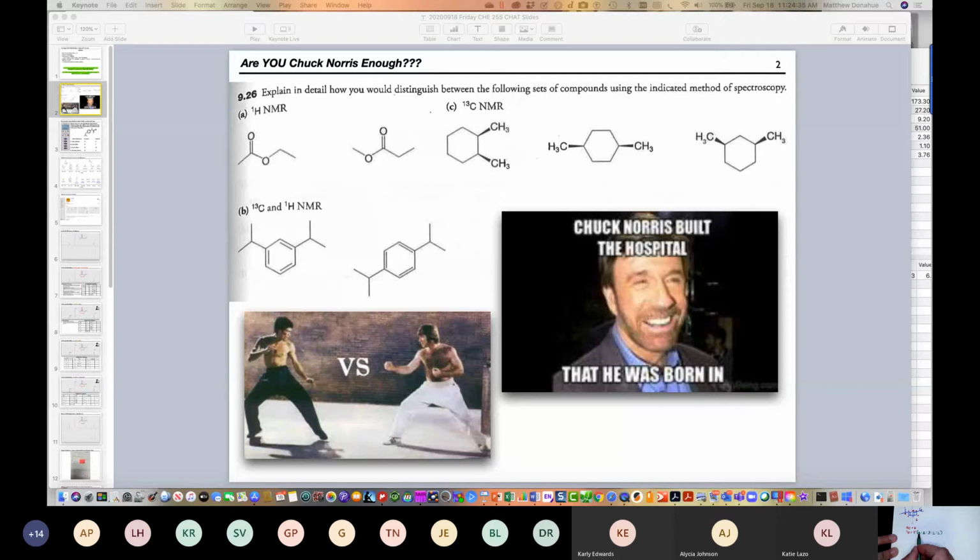And so I've been using the word ratio, which is fine because that's our empirical observation. Another word that we can use that we'll see today is called integration. So ratio or integration. Sarah's asking, do you have to put them in a certain order?